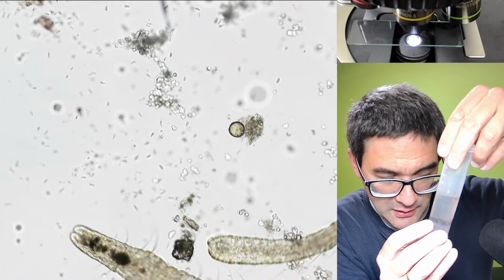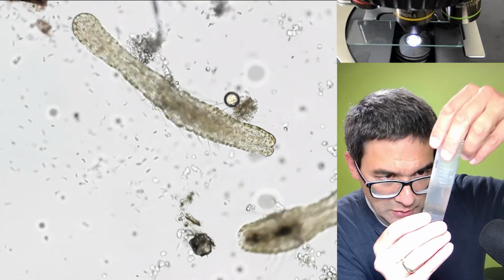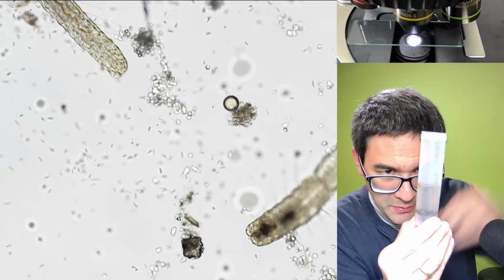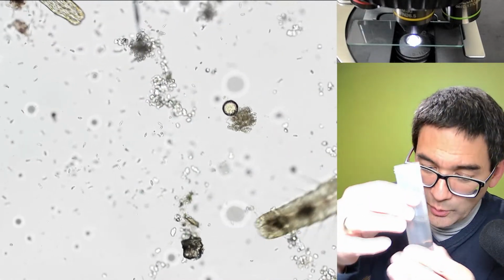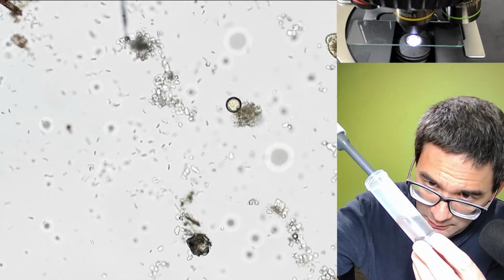I can also see that there is a little bit of cloudiness on the bottom. This is actually a sign that there could be bacterial growth happening. I mean, of course, bacterial growth happens. I'm well aware of that. But quite a bit.